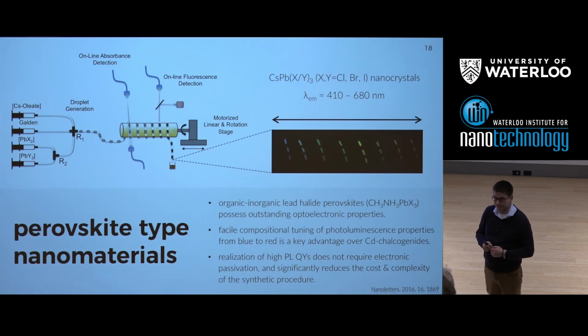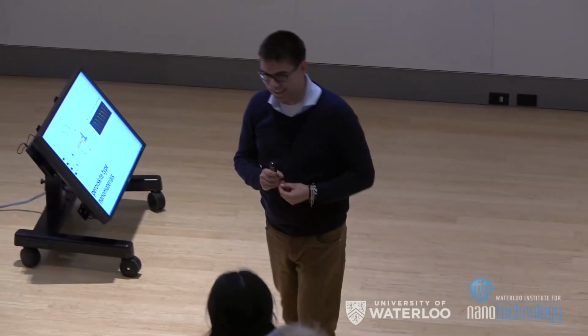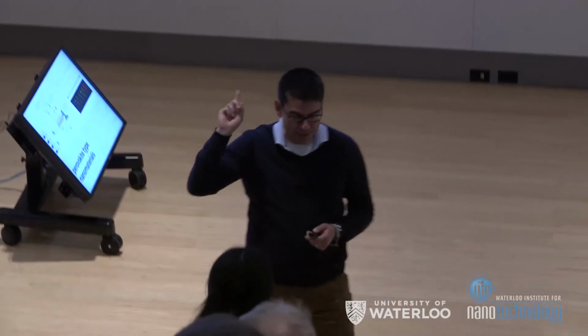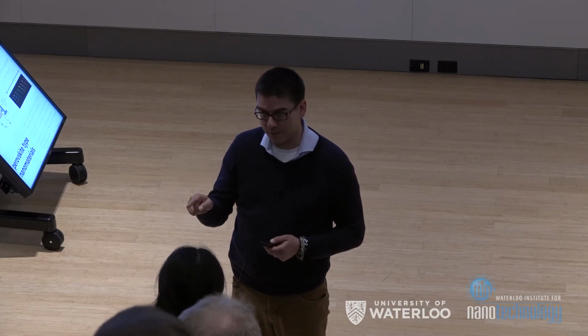Do you really measure the temperature of the droplet, or do you just rely on the heater? No, absolutely not. The data, which I haven't shown here, and again the data is in the paper, is that we use FLIM to do that. By doping a small dye molecule into the discrete phase, we can monitor the temperature, and that's really, really powerful. But that's a very good question.